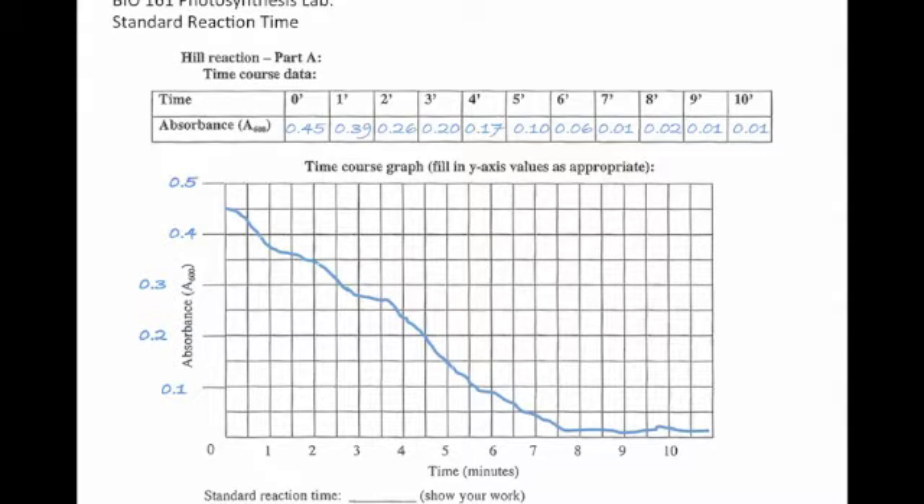Now to figure out the standard reaction time, what you're more or less going to be calculating is how long it took for about half of the DCIP in your sample to become reduced. That's going to be a function of your highest absorbance reading and your lowest absorbance reading. You're going to figure out the midpoint between those, then draw over from the y-axis until it intersects your curve and then draw down — that gives you your standard reaction time. In the case of my sample, it's been about four minutes. So for all the remaining activities, I just need to put my chlorophyll sample in the light for four minutes and then take my final reading.